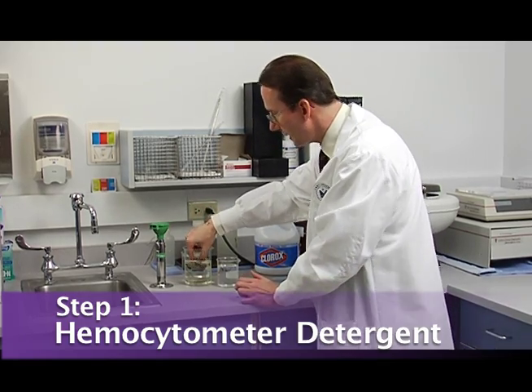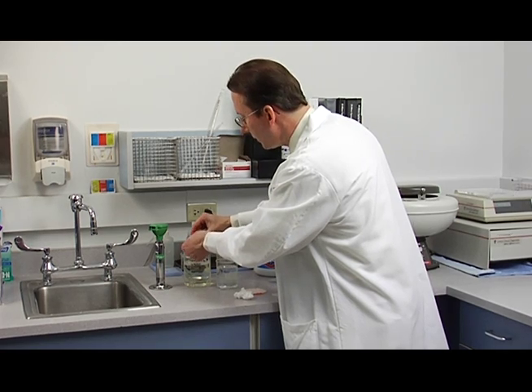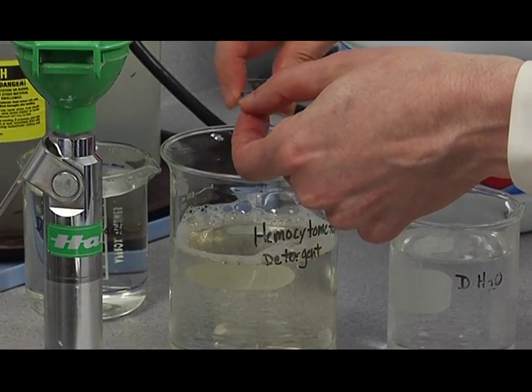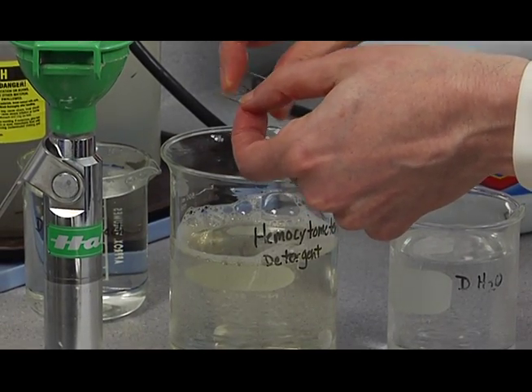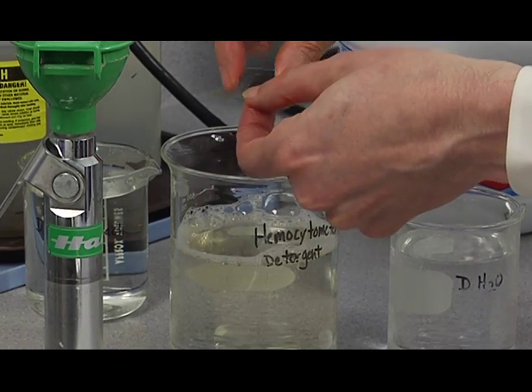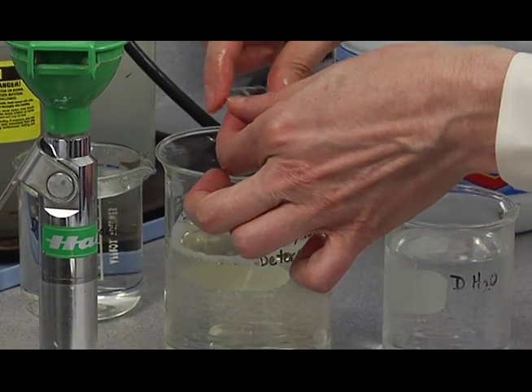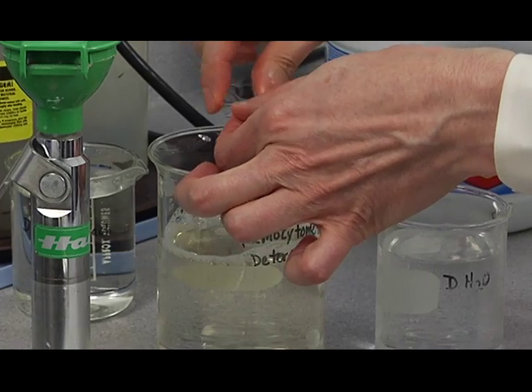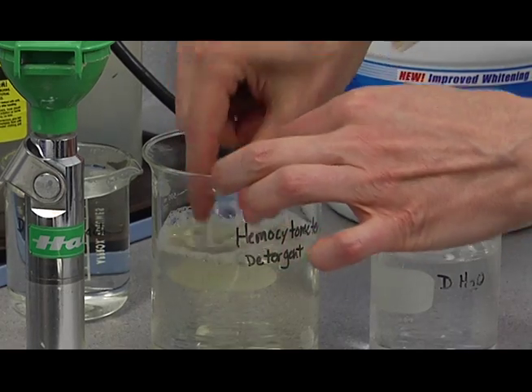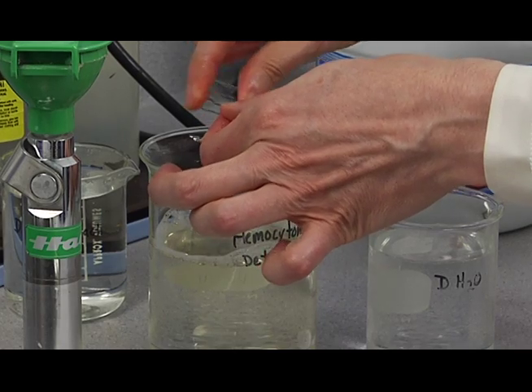And you'll swish it in the hemocytometer detergent. You can scrub it between your thumb and forefinger like this. And I pay particular attention to those corners and edges that I showed you. And I do that three times or sometimes four times, depending on how dirty it looked to begin with. Even if I've cleaned it the night before, I still clean it again in the morning.